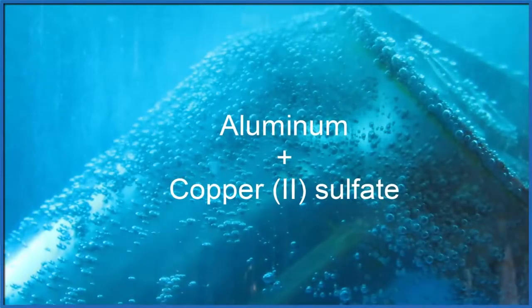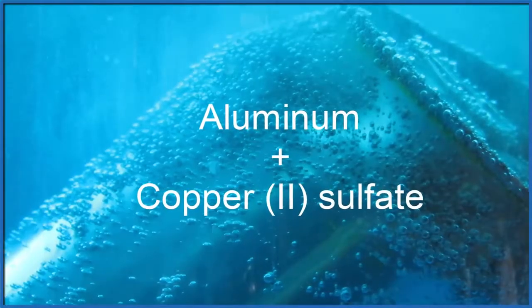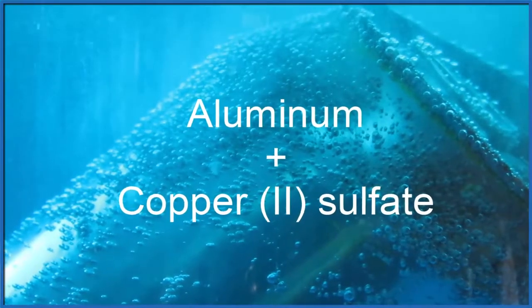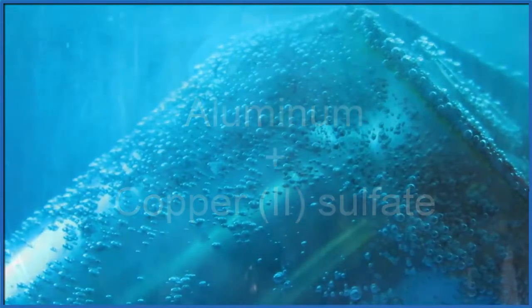In this video, we're going to react this aluminum can with this awesome crystal. It's called copper-2-sulfate. And stay with me, because at the end of the video, we'll expose the secret material on the inside of the aluminum can.